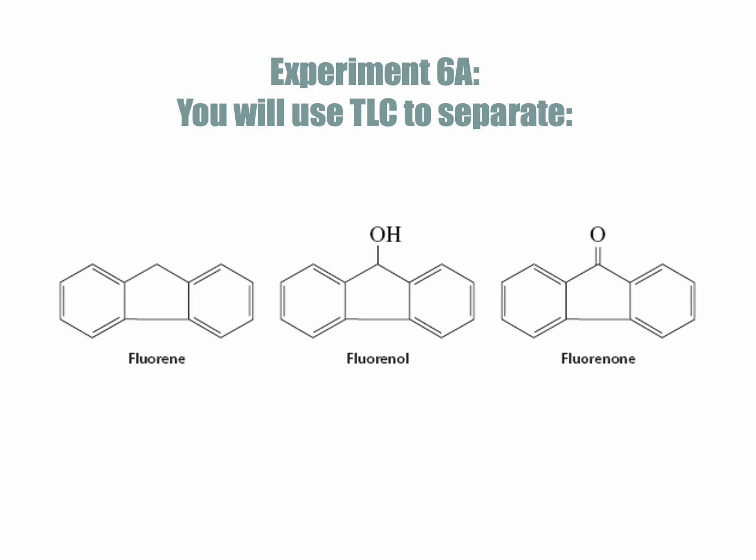You can see that these 3 compounds probably have different polarity. Think to yourself about which one is most polar and which one is least polar, and where you might expect to find those on a silica plate if we ran the experiment with the right solvent.